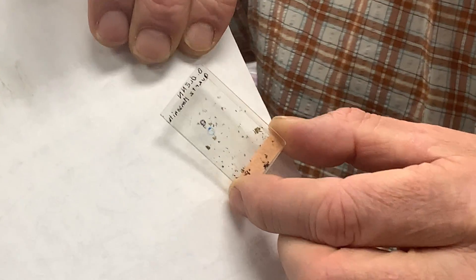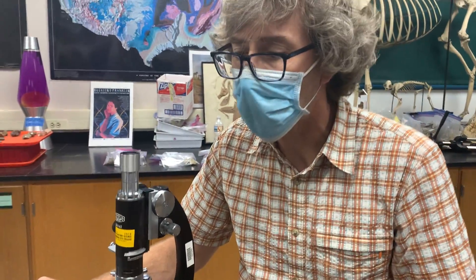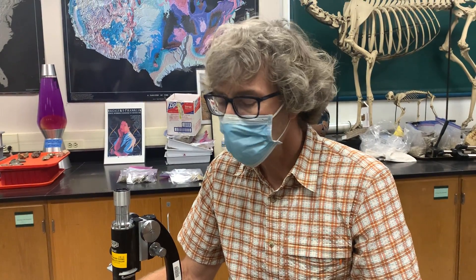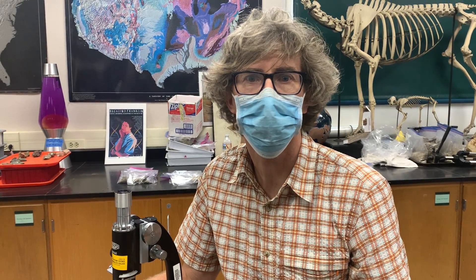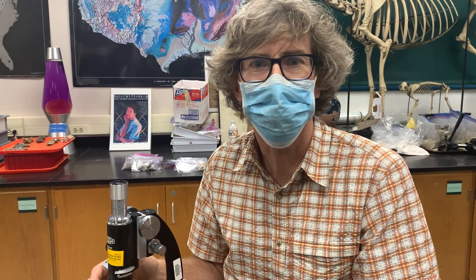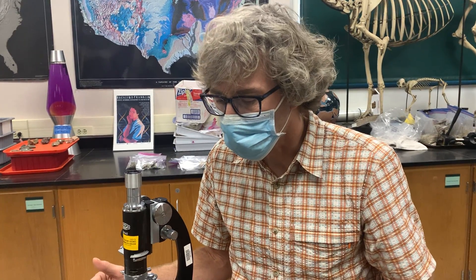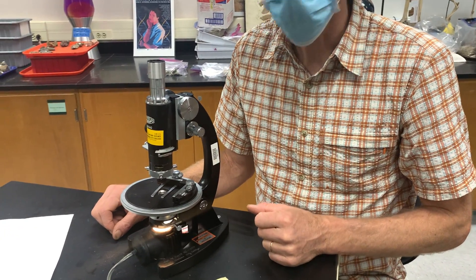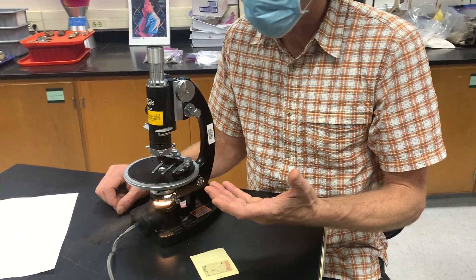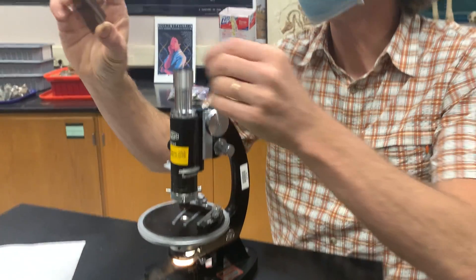They've got color, but you can still see through them. Some minerals — like the sulfides and oxides that are metallic in luster, which you've been studying — tend to be completely opaque. So even when they're only 30 microns thick, you can't see through them; they just always look black. This kind of microscope isn't so good at looking at those minerals — it's best at minerals that will transmit some light. So this is a transmitting microscope. The next really cool thing, besides getting a zoomed-in view of a thin slice of rock, is that this is a polarizing microscope. There's a polarizing filter down below, and I'm going to show you what that means.